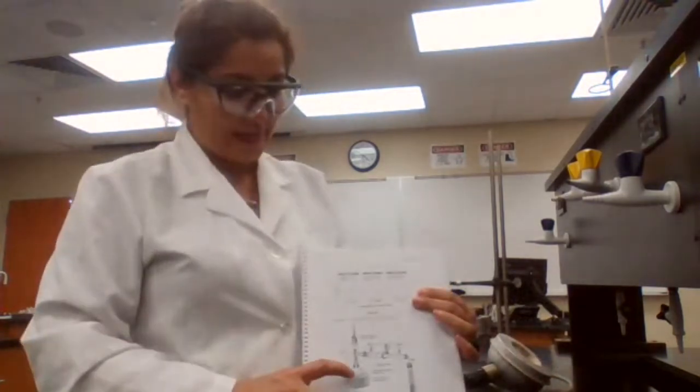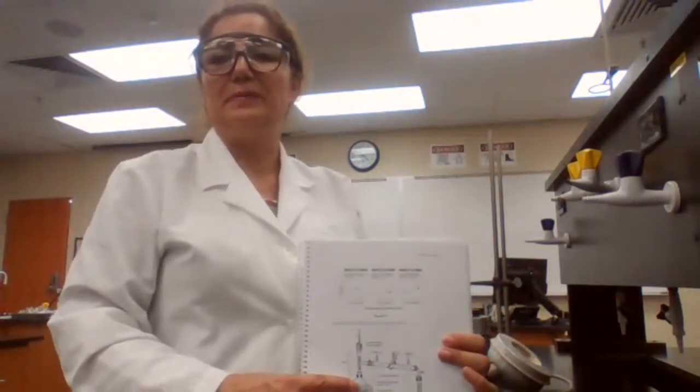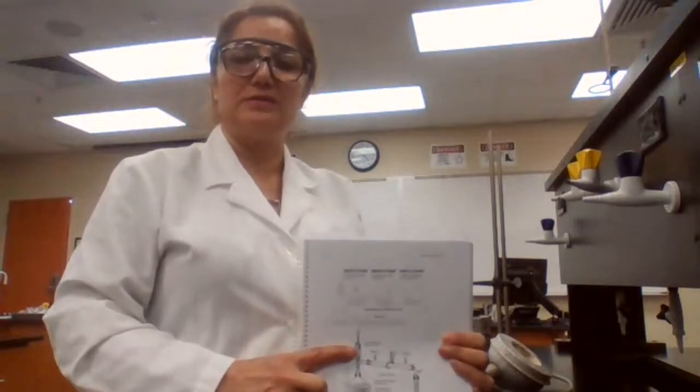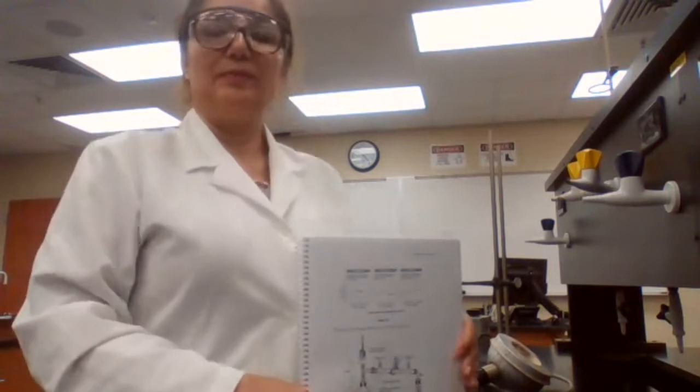In distillation, first you are going to place your sample in a boiling flask. You are going to heat up the mixture. Yes, very good. You would heat up the mixture to vapor. You take the vapor into a condenser, and the water circulation of the condenser is going to allow... Very good. Your responses are great. You are going to use the condenser to cool down the vapor and then receive it at the other end of the condenser as a more pure sample.